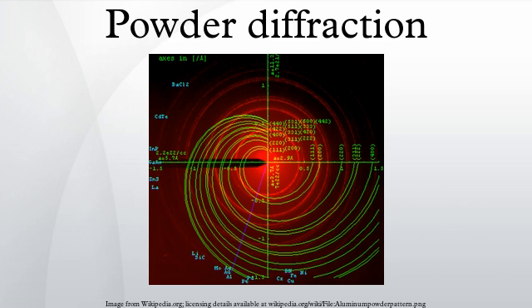Phase transitions. At some critical set of conditions, for example 0 degrees Celsius for water at 1 atmosphere, a new arrangement of atoms or molecules may become stable, leading to a phase transition. At this point new diffraction peaks will appear or old ones disappear according to the symmetry of the new phase. If the material melts to an isotropic liquid, all sharp lines will disappear and be replaced by a broad amorphous pattern. If the transition produces another crystalline phase, one set of lines will suddenly be replaced by another set.